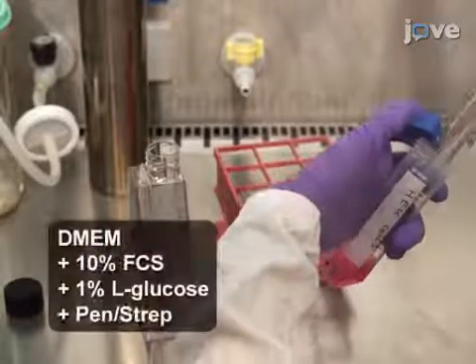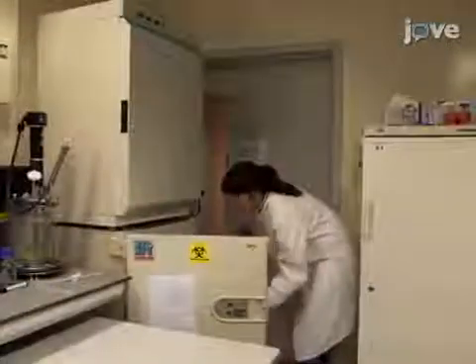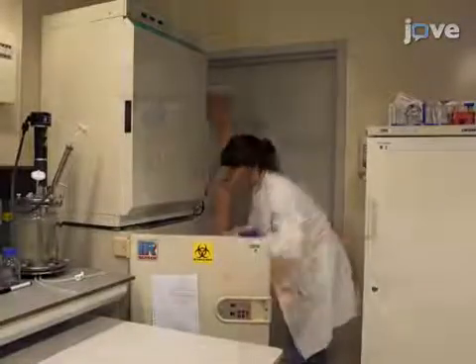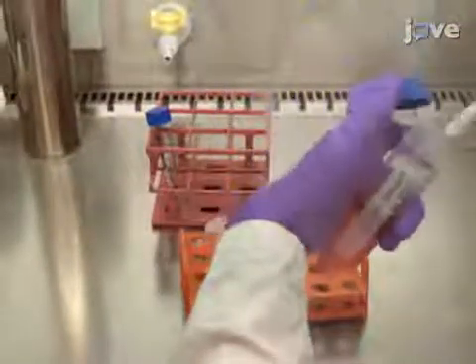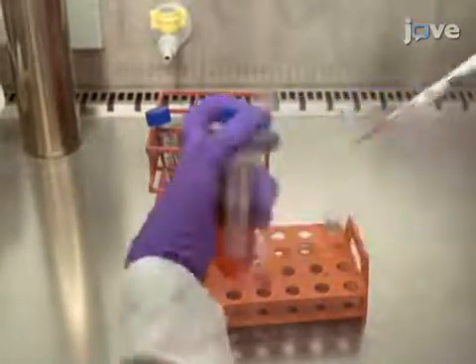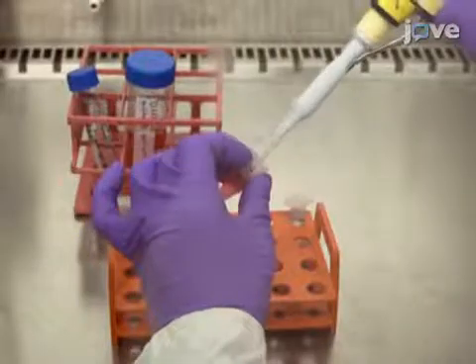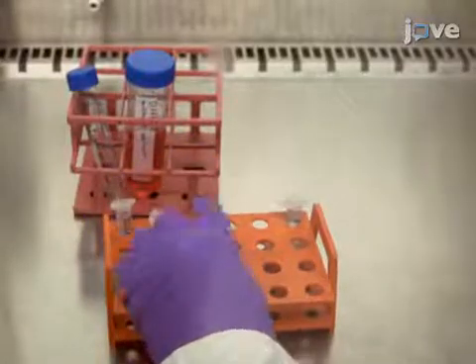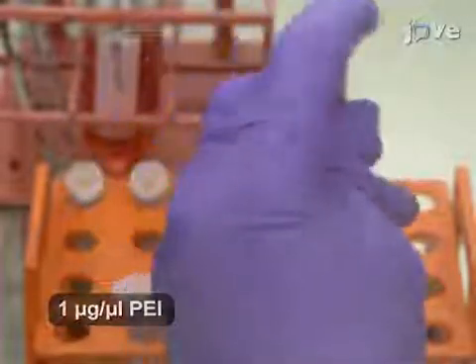Prepare the HEK cells in supplemented DMEM and grow them to 75% confluency in 75 square centimeter culture flasks. For each heavy, light chain transfection, prepare a mix with 1.75 milliliters of DMEM without serum. Include 4.5 micrograms of heavy chain vector, 3 micrograms of light chain vector, and 50 microliters of polyethylenimine solution.